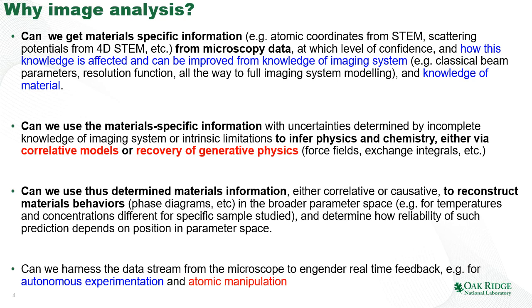So this is the question of how we can get material-specific information from microscopy data, and of course the important issue is at which level of confidence, how much do we trust these answers? How is this knowledge affected by, and how can it be improved from, the knowledge of the imaging system? And how can it be improved by the knowledge of the material? I will show you a few examples when we do exactly that.